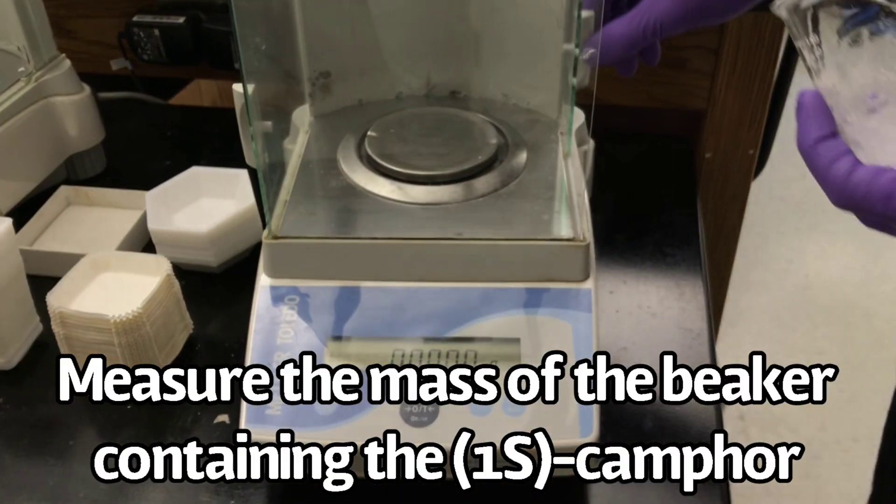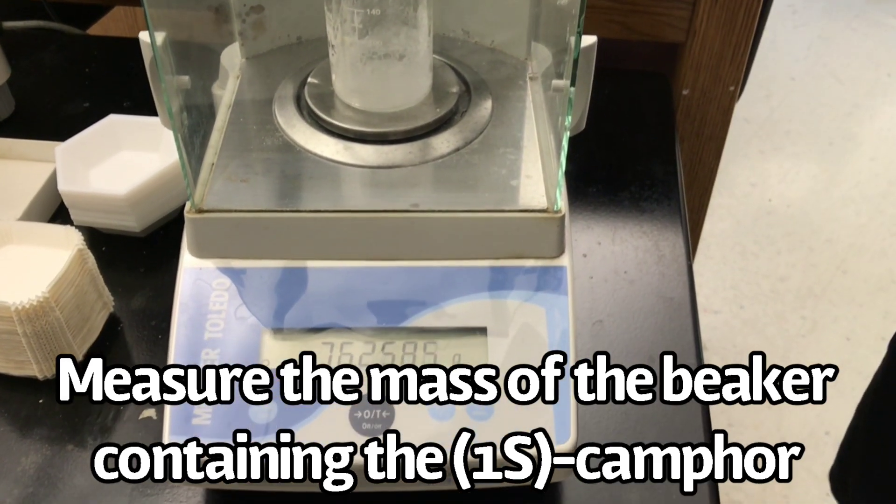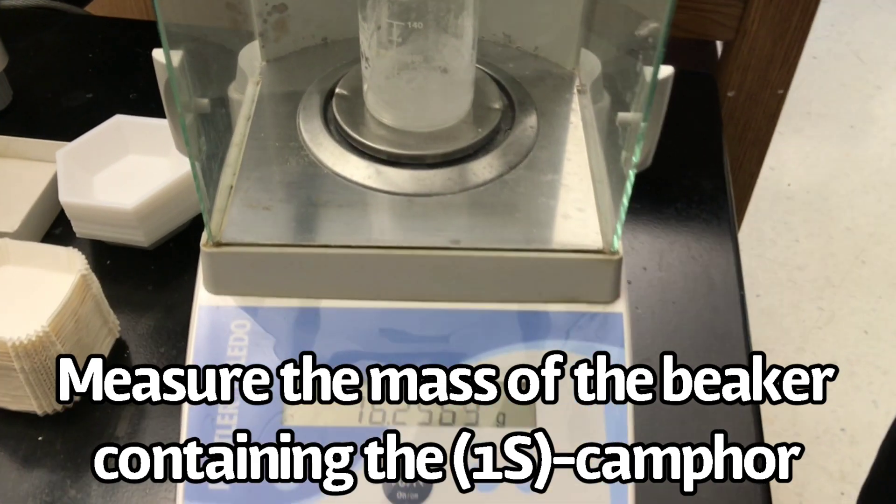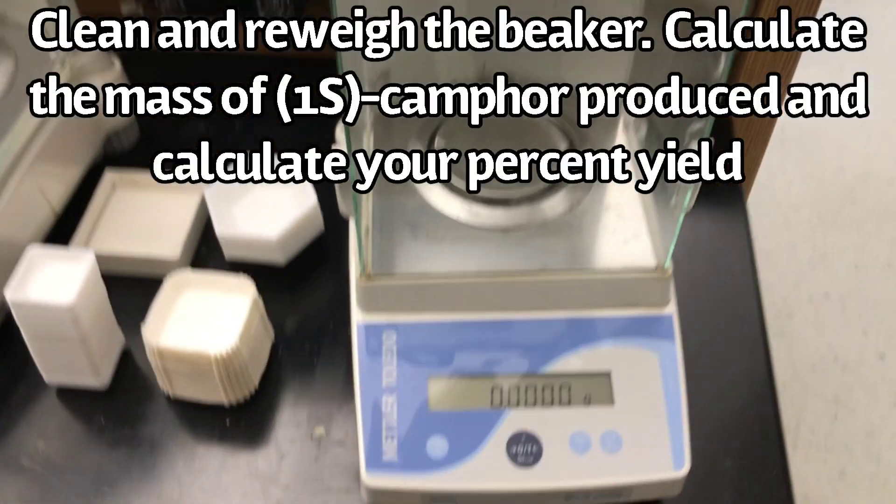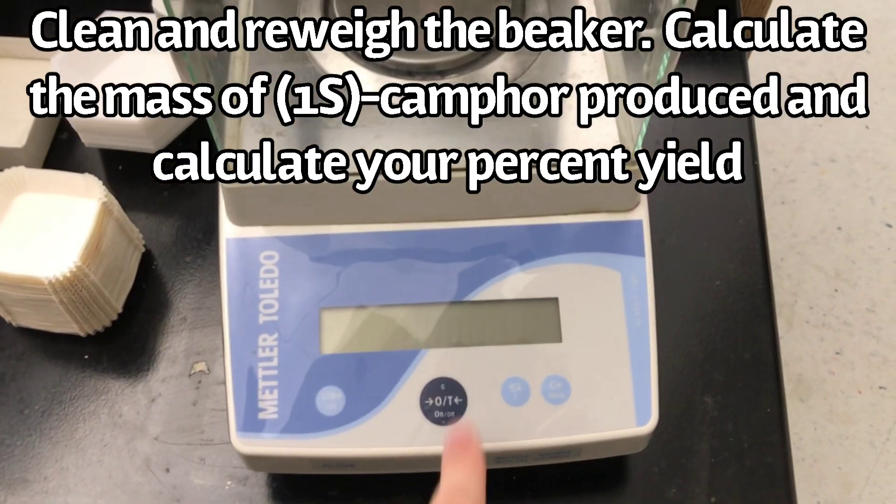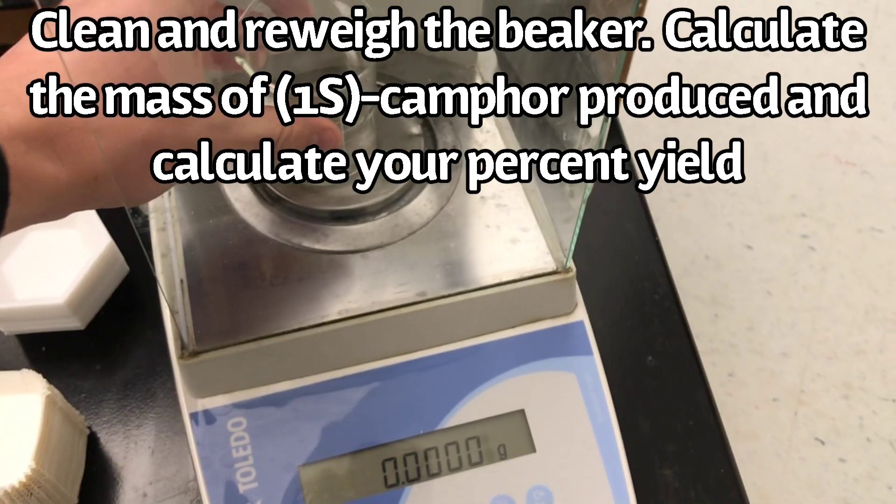Measure the mass of the beaker containing the S-enantiomer of camphor. Clean and re-weigh the beaker, then calculate the mass of camphor produced, then calculate your percent yield.